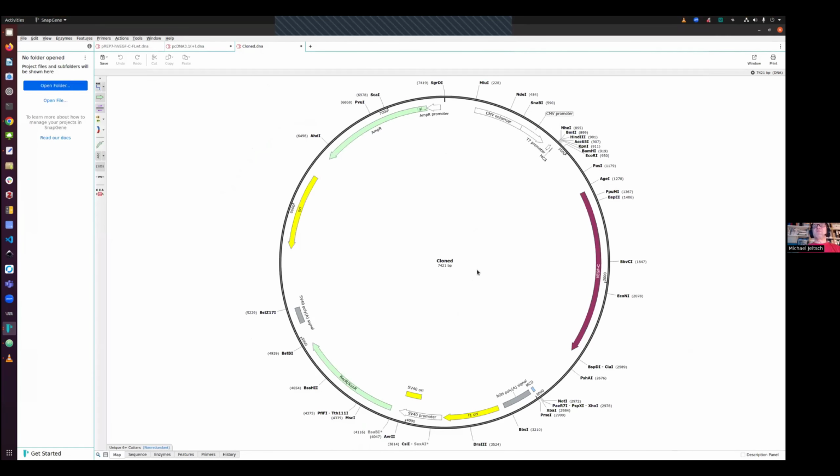However, some of you have probably been used to doing cloning from Microsoft Word or any other text editor, which is definitely possible because the program SnapGene allows you to do that using Control C and Control V, meaning copy and paste, like you do in a text processor. And that works. The program allows you to do this. The problem is that you usually make mistakes when you do that, because it's actually quite difficult.